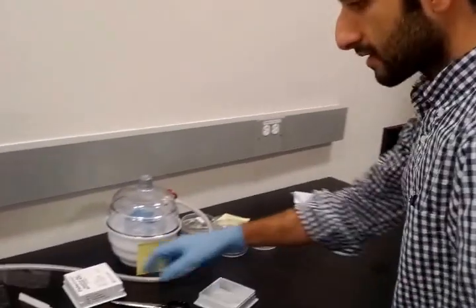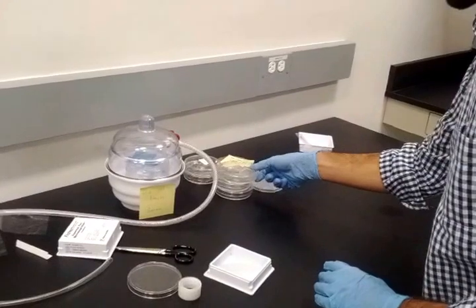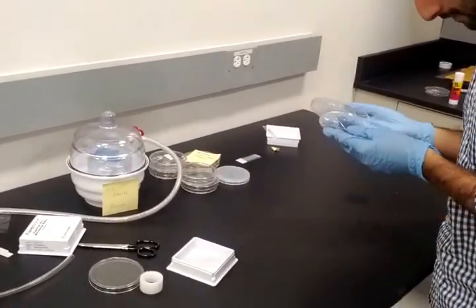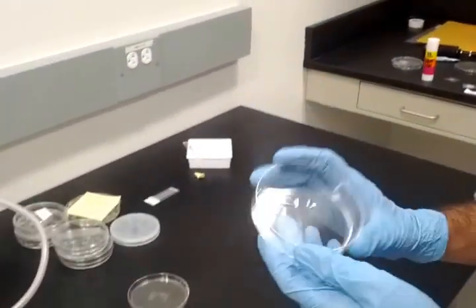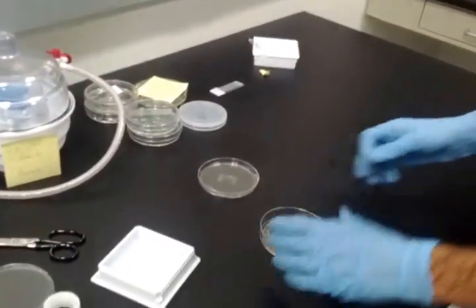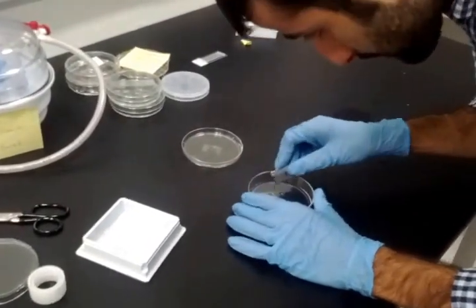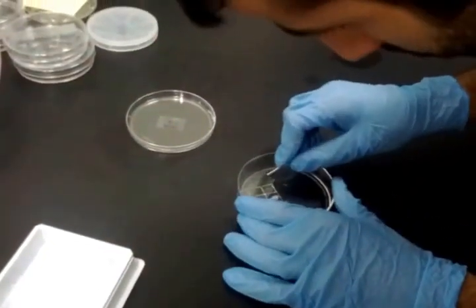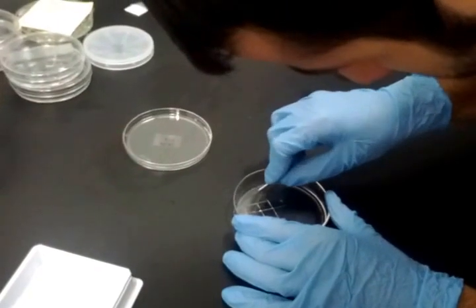Okay, so we have our microscope slides here, and we are going to use some PDMS that we made a while ago. Okay, Eugene was asking about these grid lines. Those are from cutting PDMS into small pieces so we can exfoliate on them one by one. And there's already some, but I'm going to cut one more just for the purpose of demonstration.